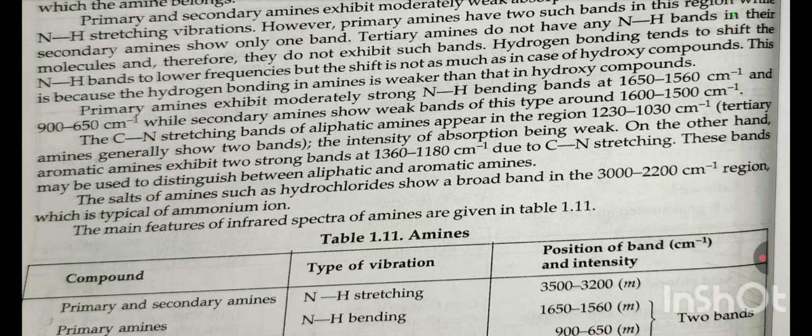Primary amines exhibit moderately strong NH bending at 1650 to 1560 cm⁻¹ and 900 to 650 cm⁻¹, while secondary amines show weak bands of this type around 1600 to 1500 cm⁻¹.